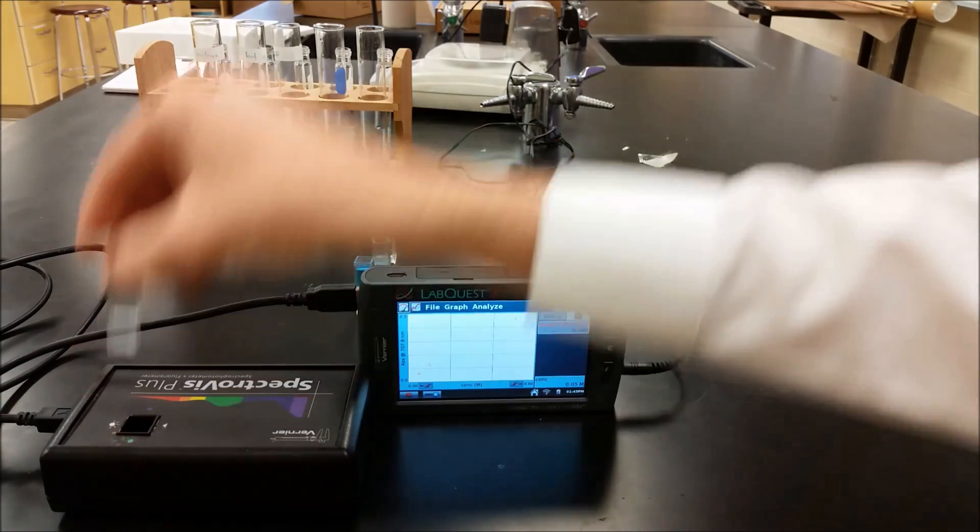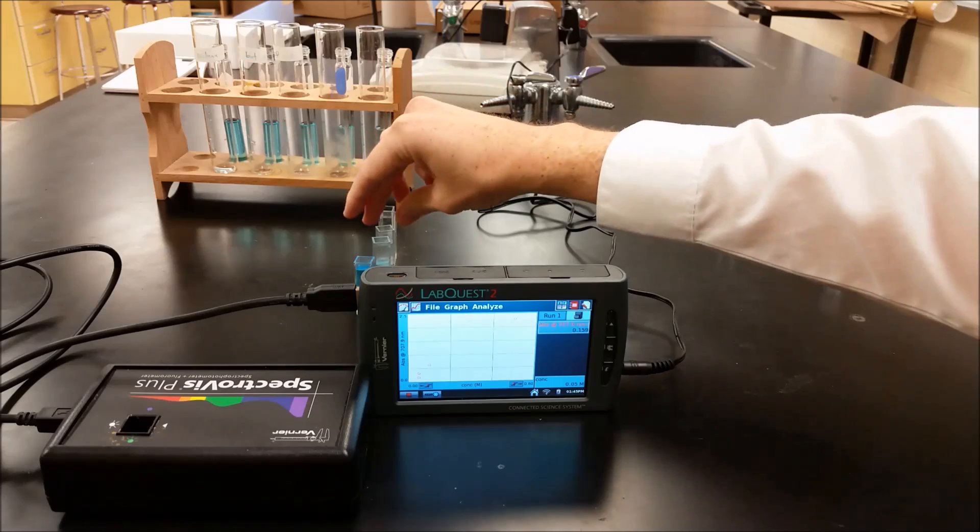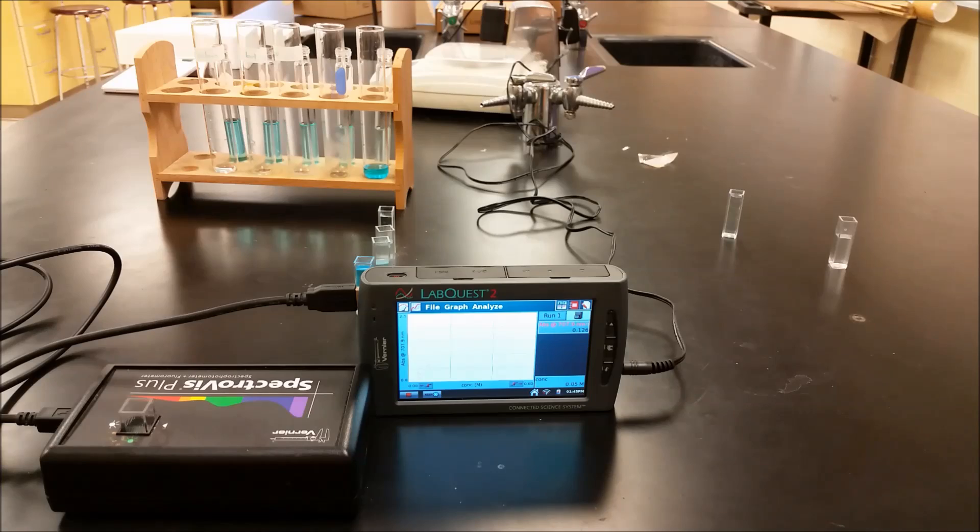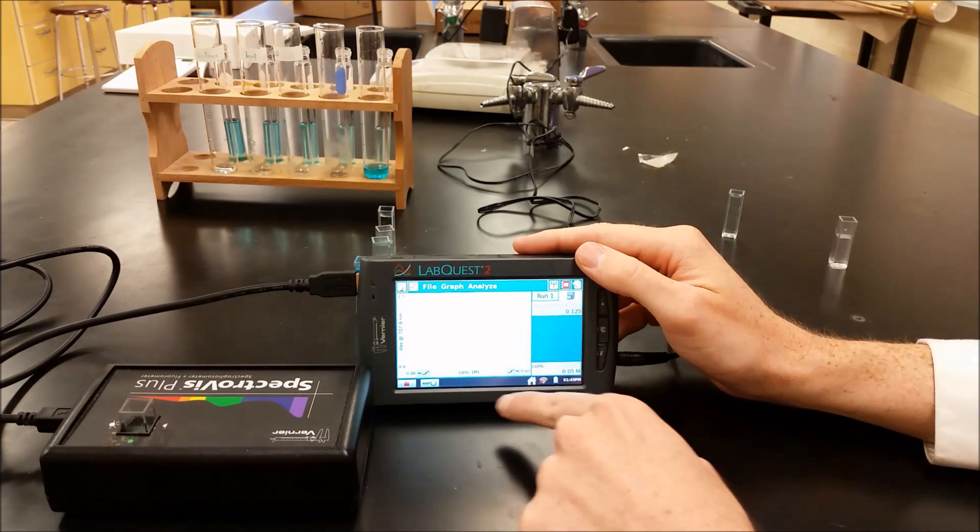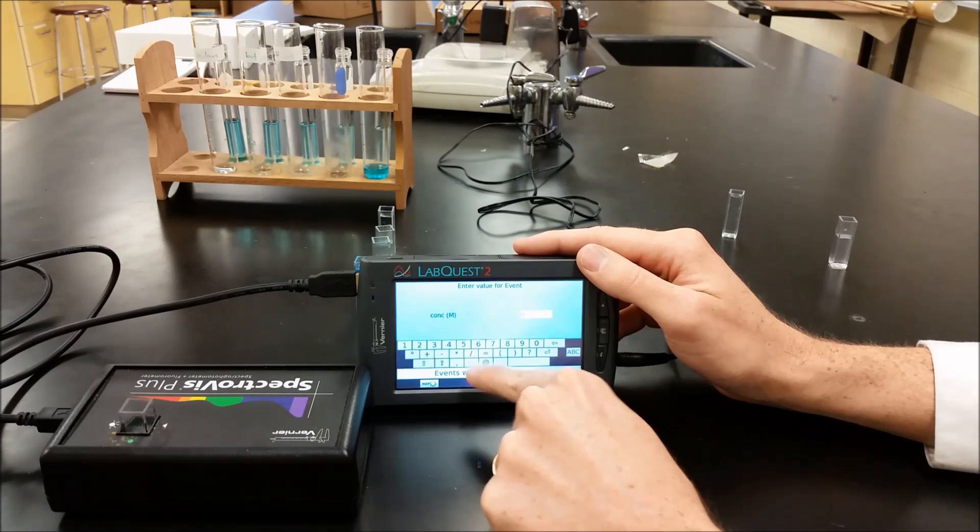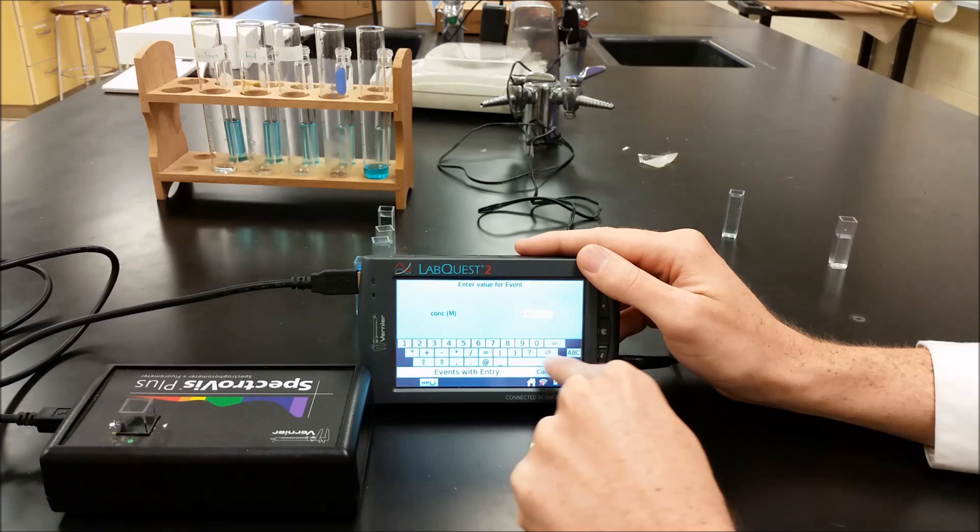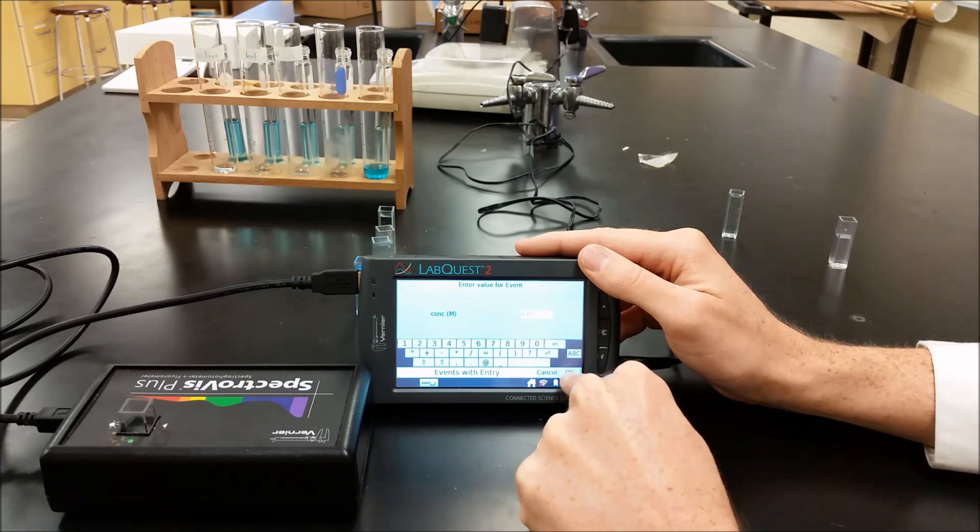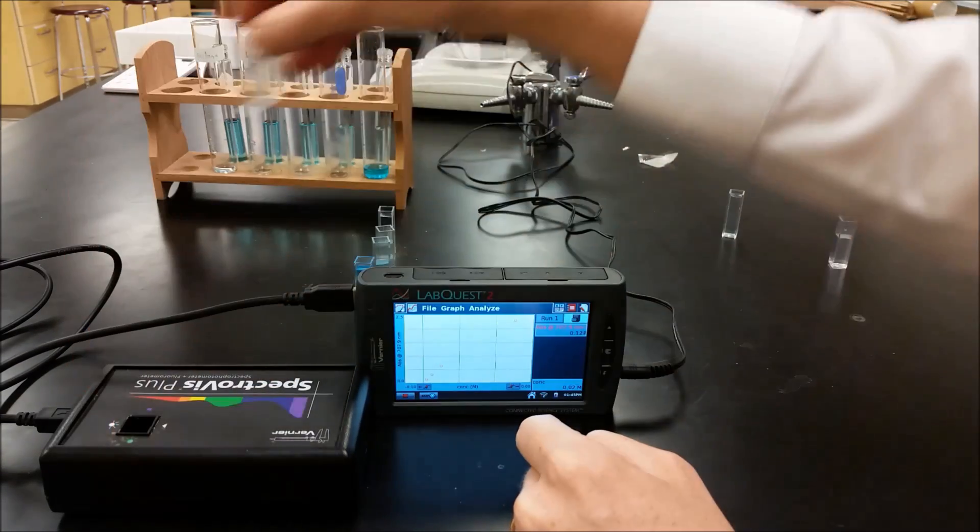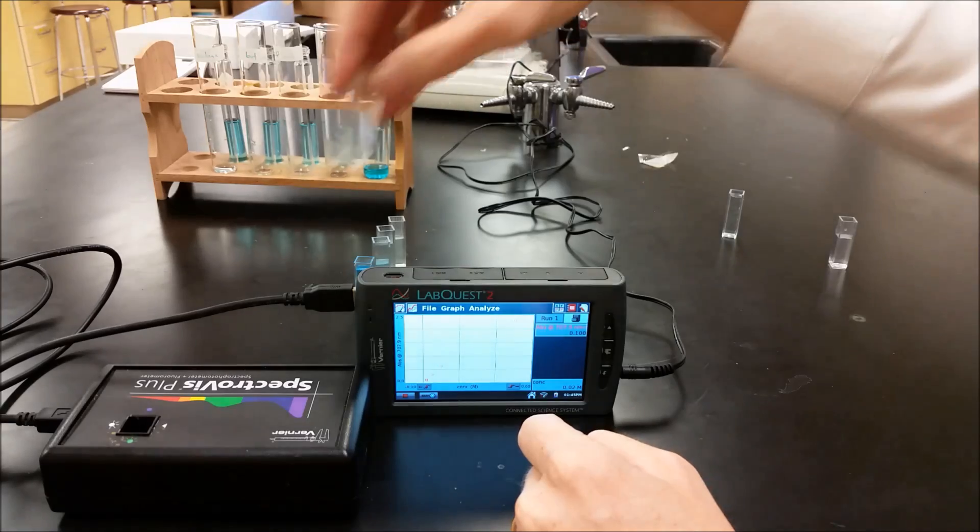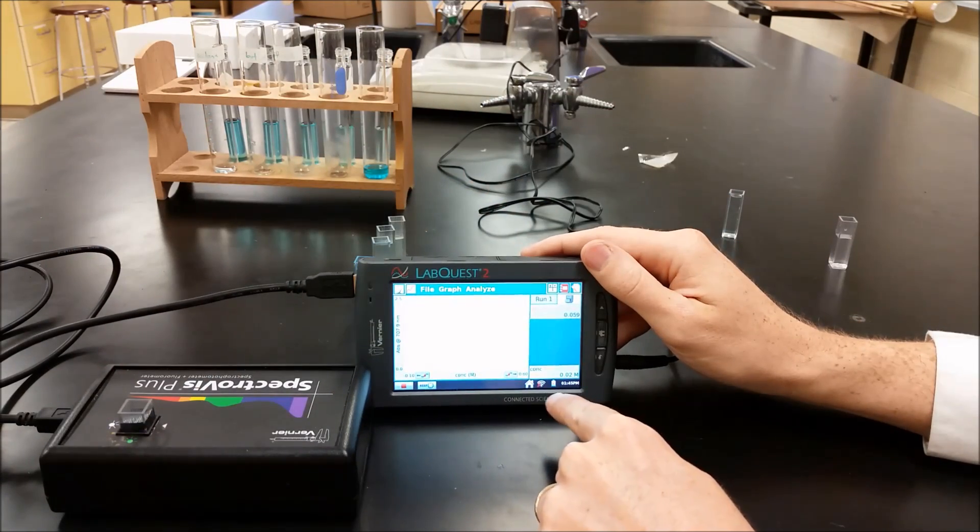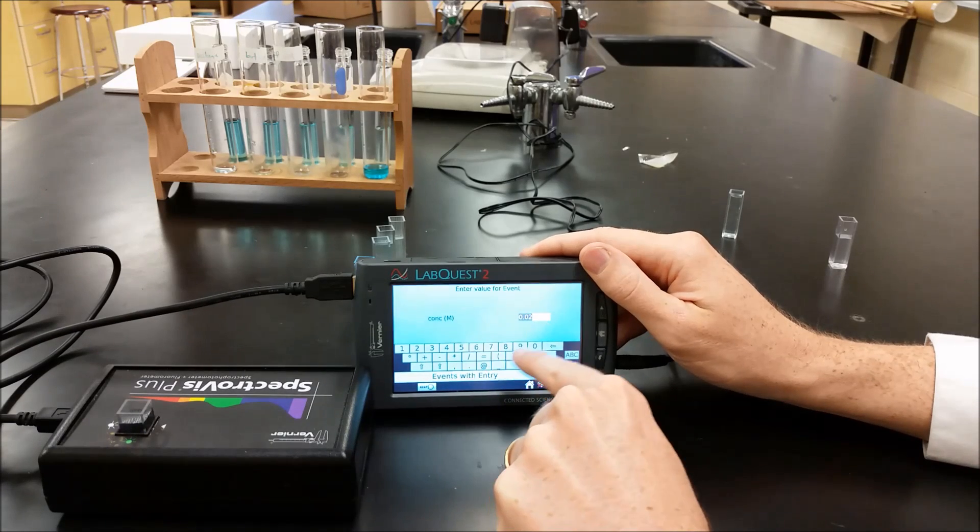Okay. And we'll go ahead and keep that. And this is 0.02. Okay. And you can see that we're kind of developing this line. Whereas the concentration goes down, we get less and less absorbance, and proportionally so. So our last value here is 0.01.